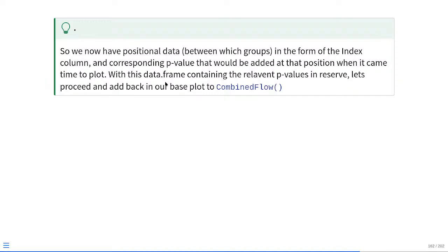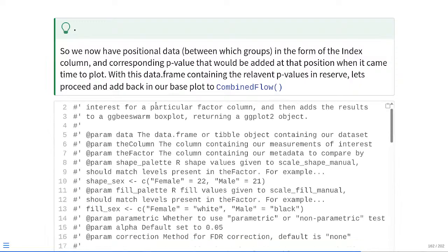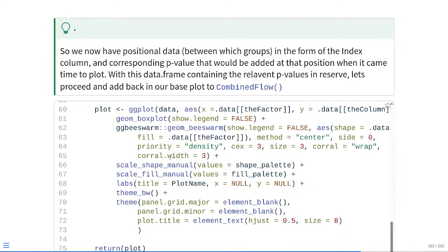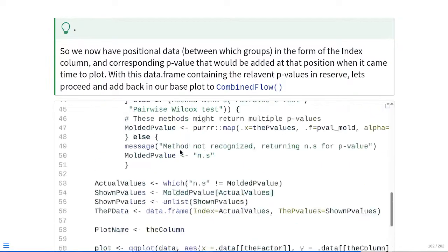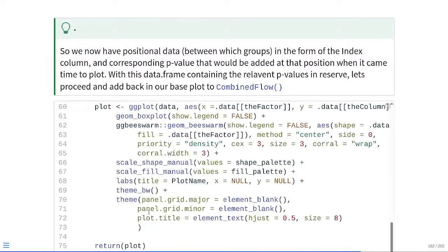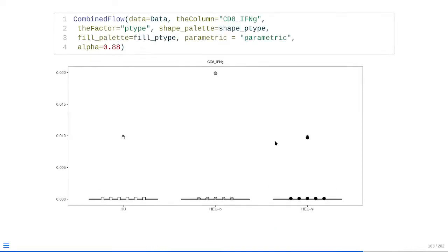So let's go ahead and copy in the code that actually is generating the beeswarm box plot at that point. So going past where we had left off, just copying and pasting in our existing lines of code, and then modifying any of those additional arguments to handle the situation that we expect to for ggplot2, and changing our return right now to plot just to make sure everything's working. And we get back this semi-ridiculous looking plot for this particular response variable that we're checking.